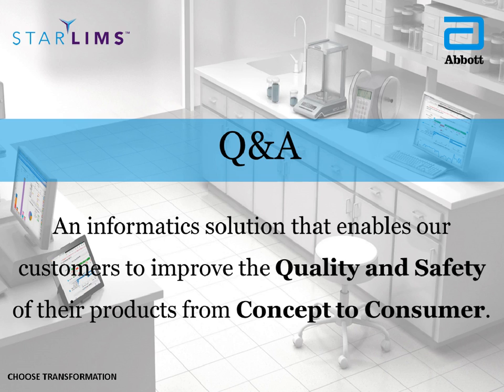We are right now also in the process of having, for example, manual aliquoting processes. That could be another solution when the laboratory doesn't necessarily have an automated liquid handler instrument to do that, and the space is very restricted. A mobile app perhaps could be one very useful solution. But not only mobile apps. Think about touch screen monitors too. Sometimes that is another very good option.